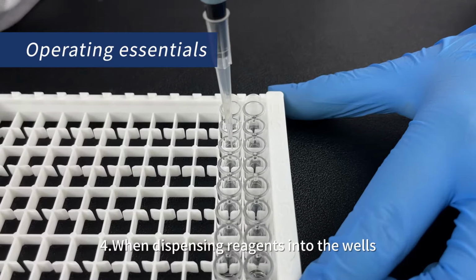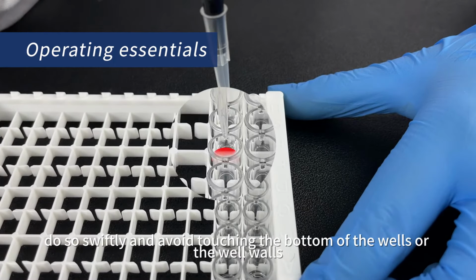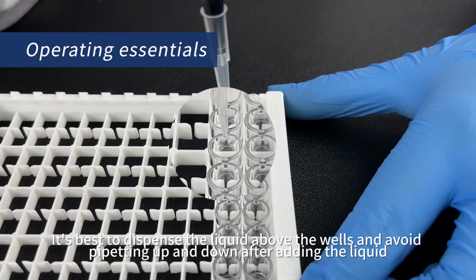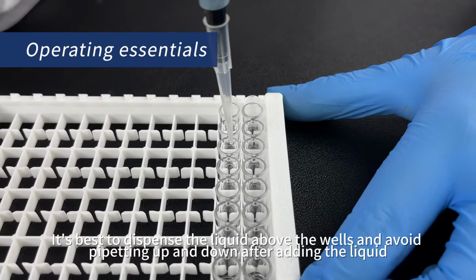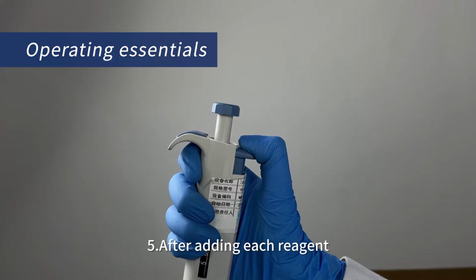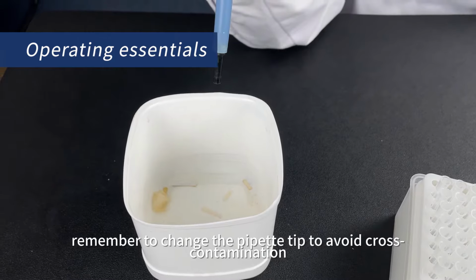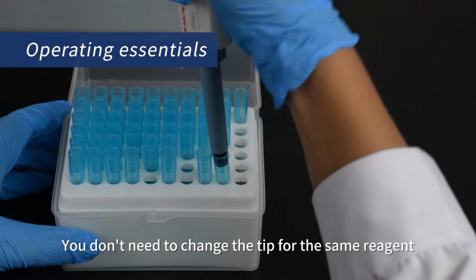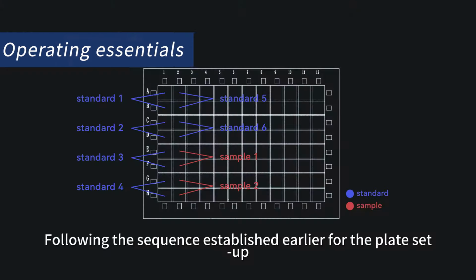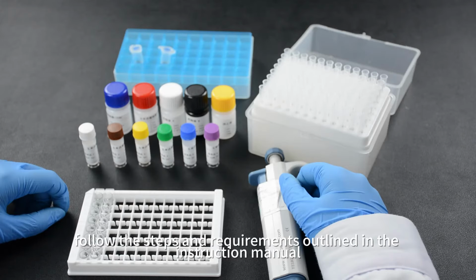4. When dispensing reagents into the wells, do so swiftly and avoid touching the bottom of the wells or the well walls. It's best to dispense the liquid above the wells and avoid pipetting up and down after adding the liquid. 5. After adding each reagent, remember to change the pipette tip to avoid cross-contamination. You don't need to change the tip for the same reagent. Following the sequence established earlier for the plate setup, follow the steps and requirements outlined in the instruction manual.